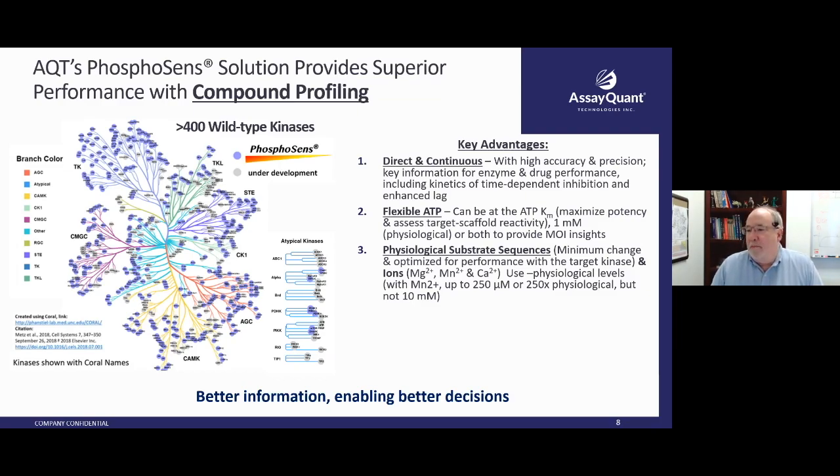We incorporate our SOX moiety as a cysteine-linked residue during the peptide synthesis. Getting the SOX moiety to exactly where it needs to be on the full-length protein is something tricky. It is something we've talked about. It's something that we might be interested in exploring in the future, but it's not something we've developed just yet.